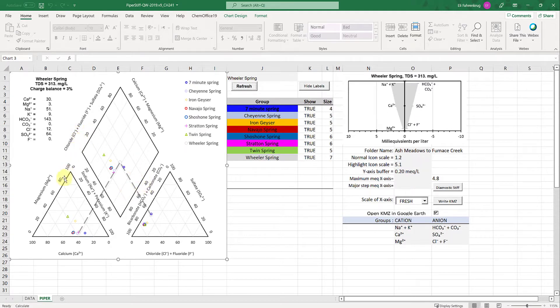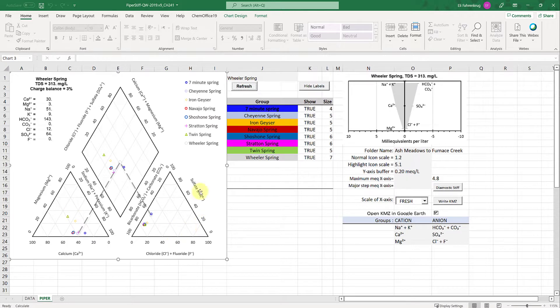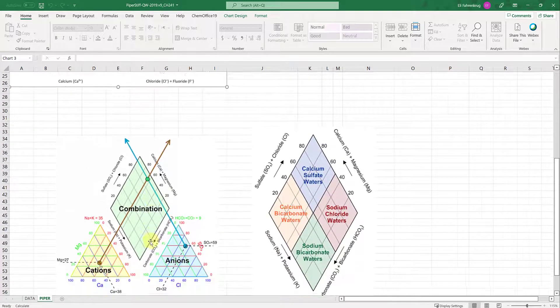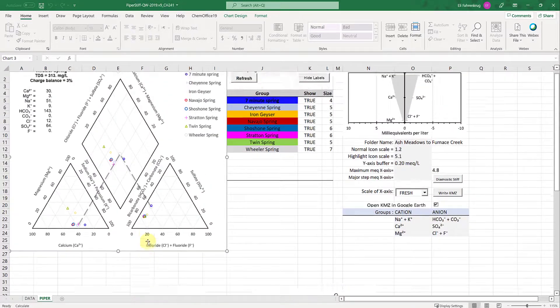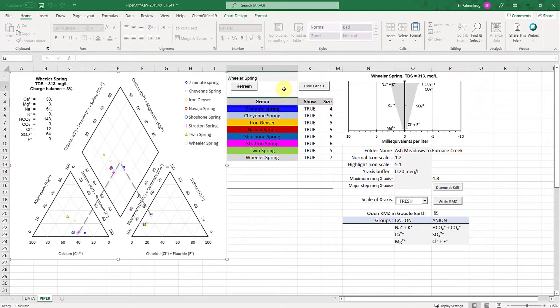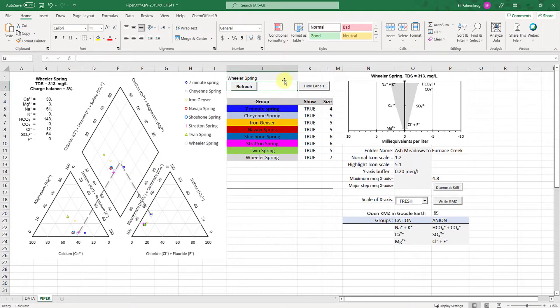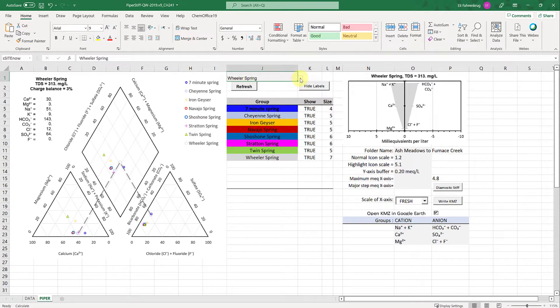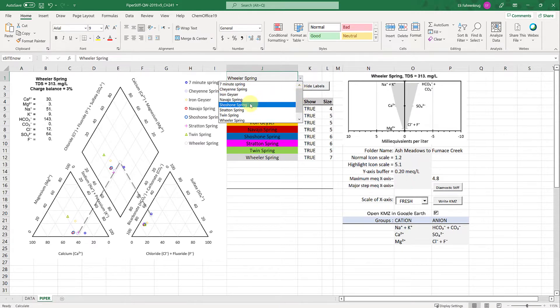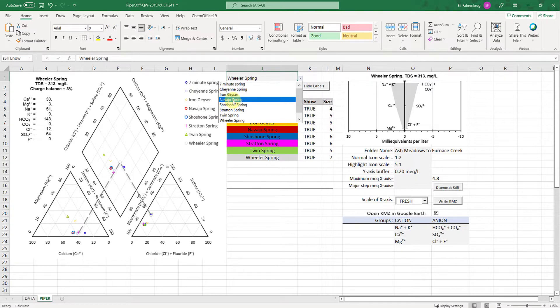When looking at this plot, remember this triangle is cations, this triangle is anions, and you always have a reminder down here. What's cool is I can go to this gray box drop-down which lists all of my samples. I can see what the Navajo spring specifically is, where that point is on this plot, because all points are plotted simultaneously.